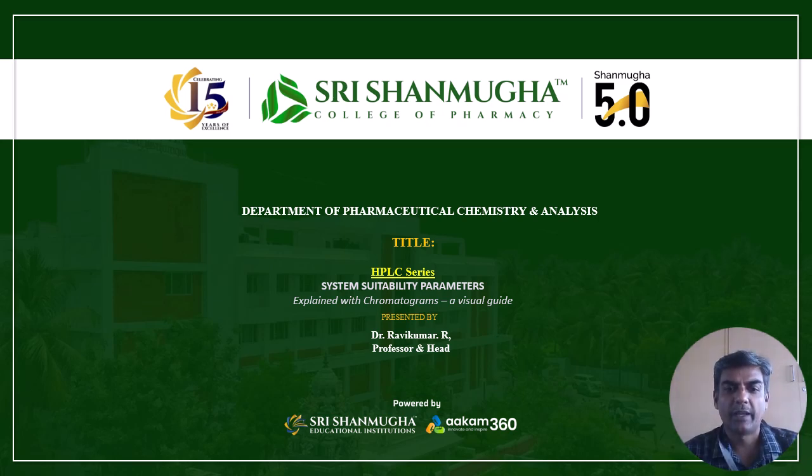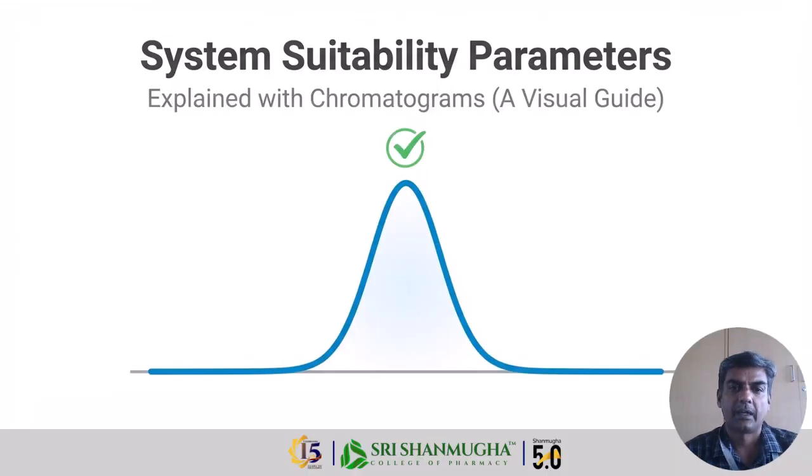Hi all. Today we are going to see about system suitability parameters in HPLC. We are going to understand one of the most important concepts in HPLC analysis. System suitability parameters. That is called system suitability parameters. Now don't worry about the name. It may sound technical, but in reality it is very simple.